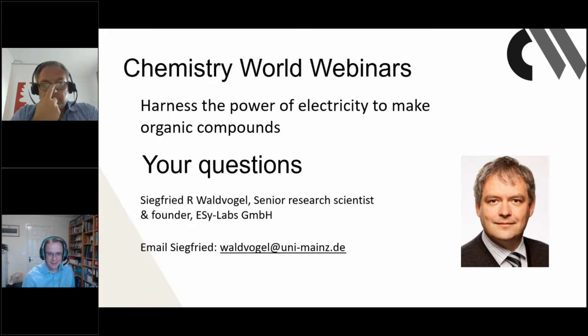Okay, so we've got one more question from Hussein, who's asking about refreshing carbon electrodes. Towards the start of the presentation, you were talking about different ways of doing it, and that depends on the structure and material of the electrode.